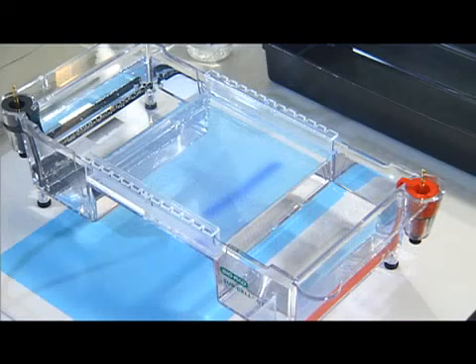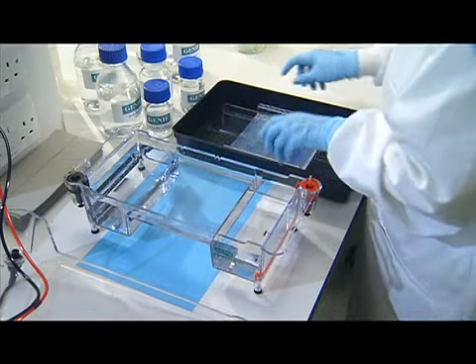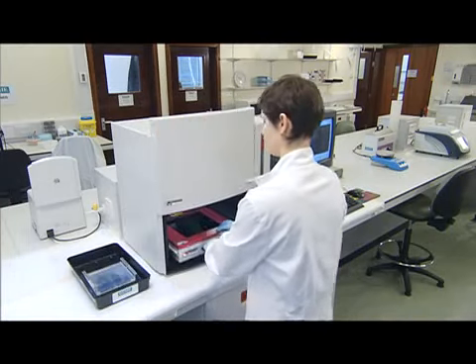Once the fragments have separated sufficiently, it's time to visualize them. This is done with the aid of chemicals which were added to the molten gel before it was poured. SYBR Green dye can be used, but the best and therefore most commonly used chemical is ethidium bromide. These chemicals stick to the nucleic acids and fluoresce under ultraviolet light. SYBR Green is safer but less sensitive than ethidium bromide, which is a strong mutagen.